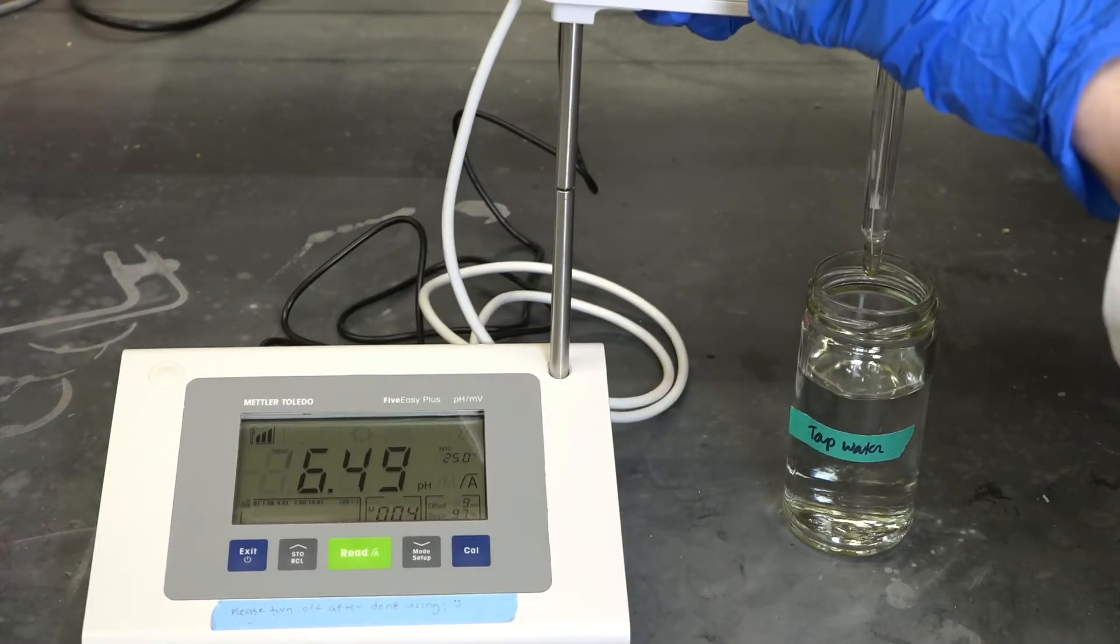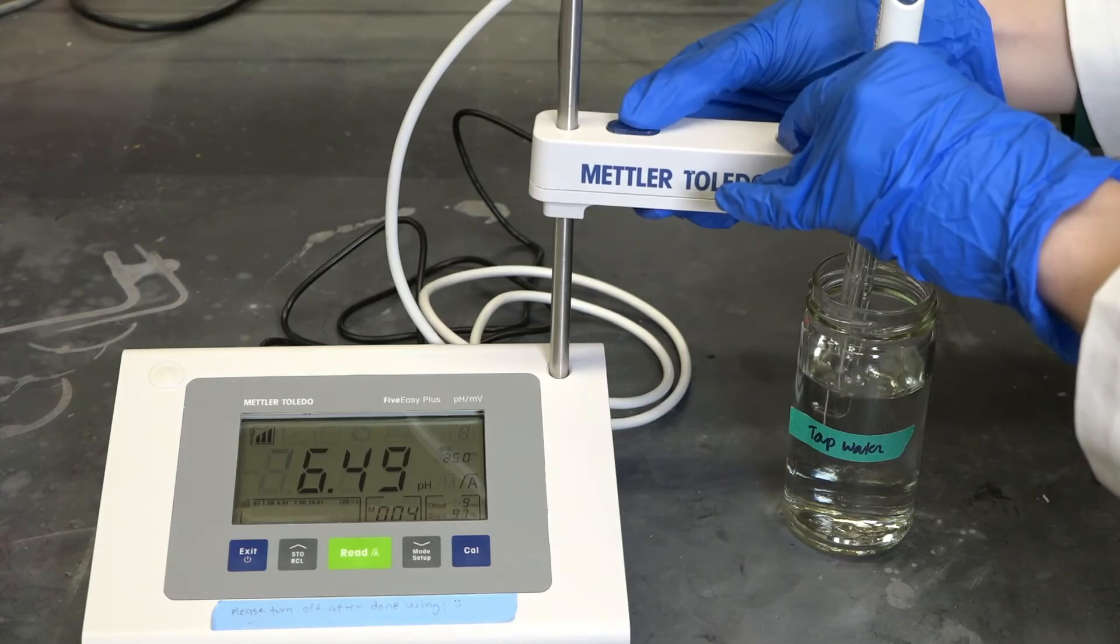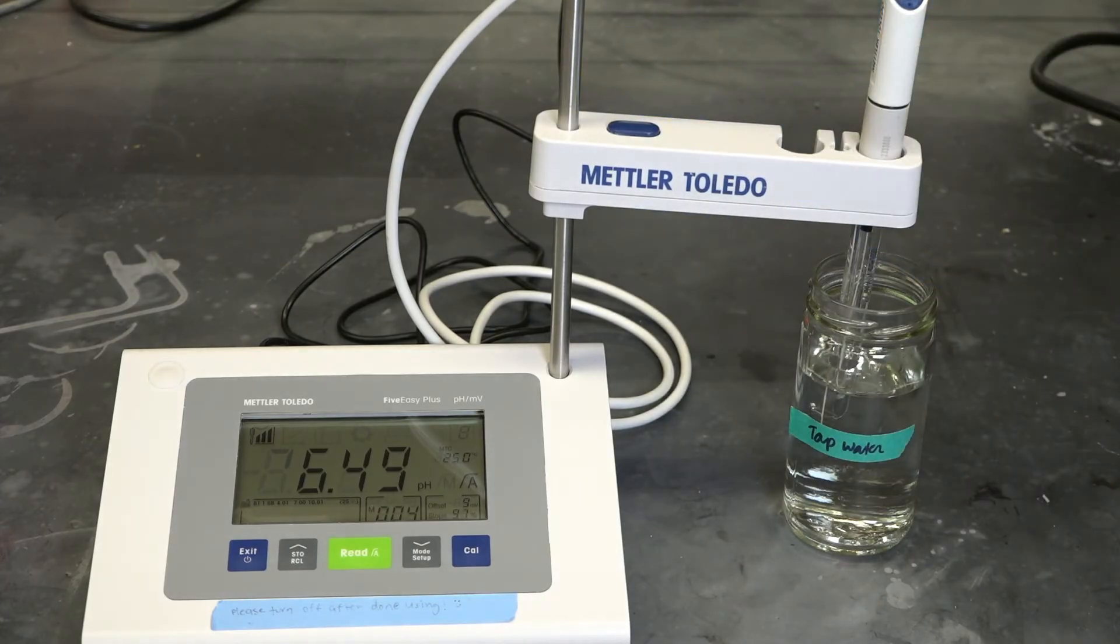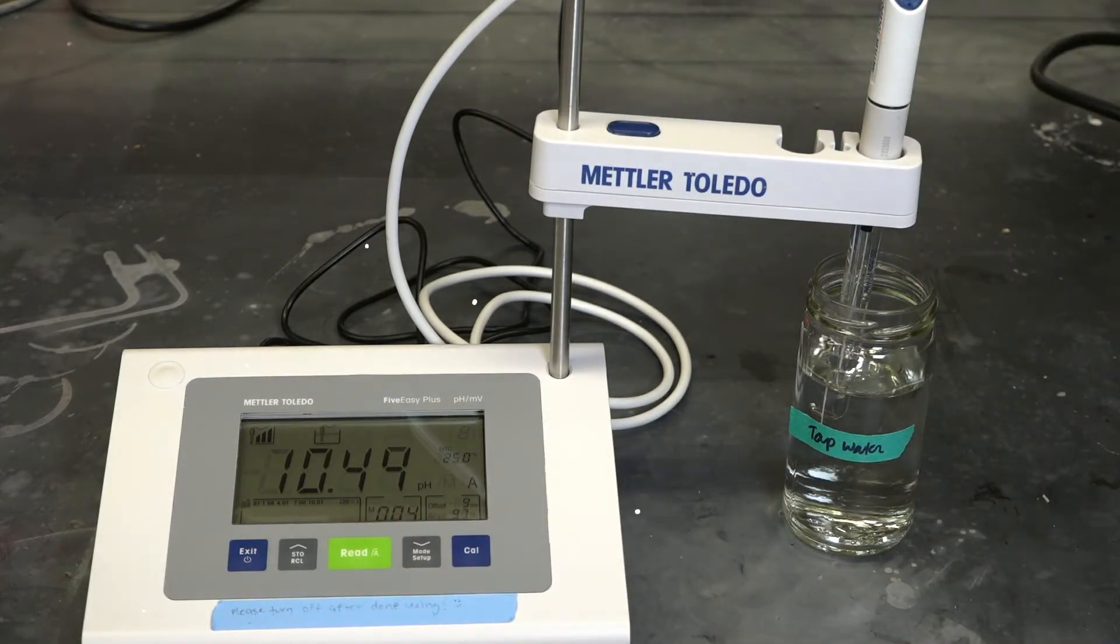By now you're a pro at electrode submersion, but this time, instead of hitting the calibrate button, you're going to hit the read button. Wait for the readout to stabilize. pH meters will often give a little beep to let you know when they're done reading the pH. So polite.